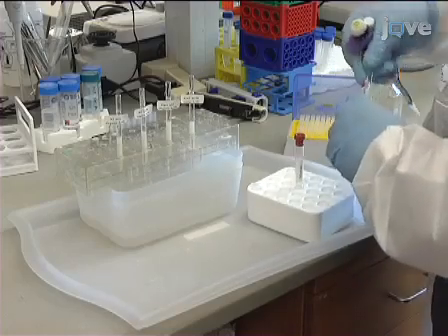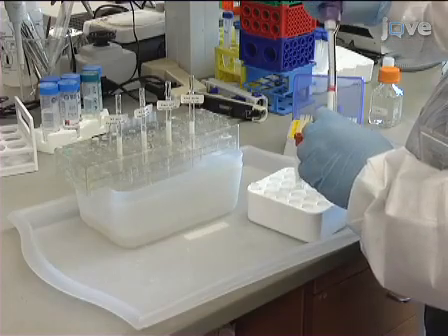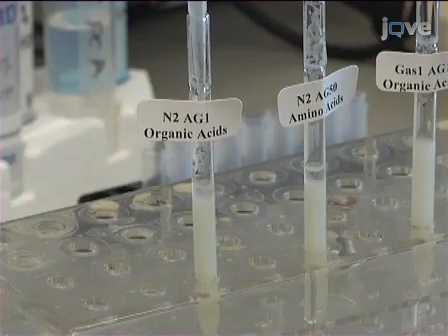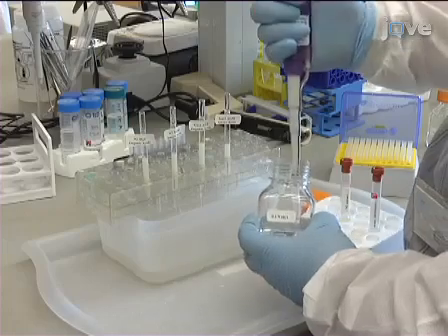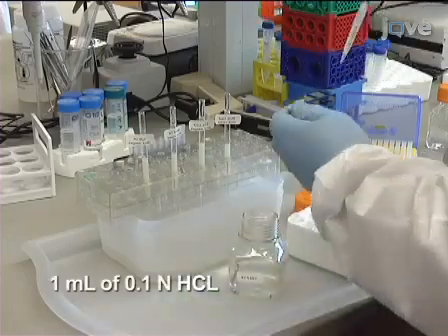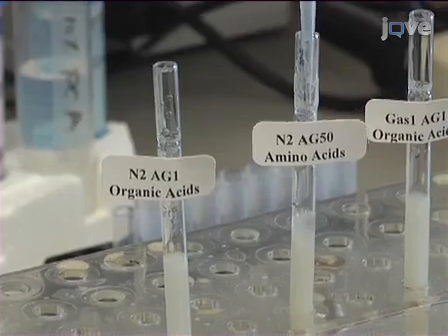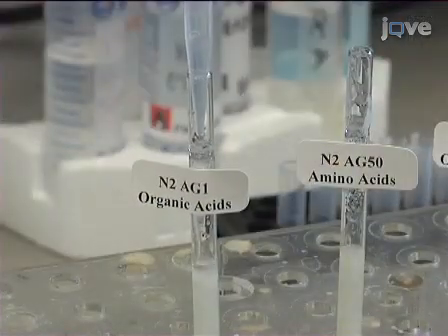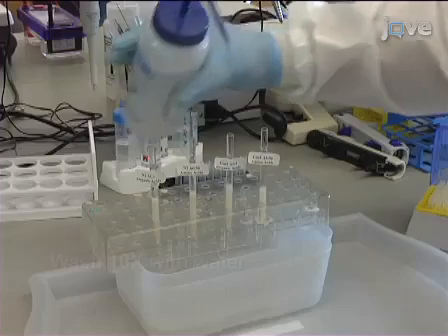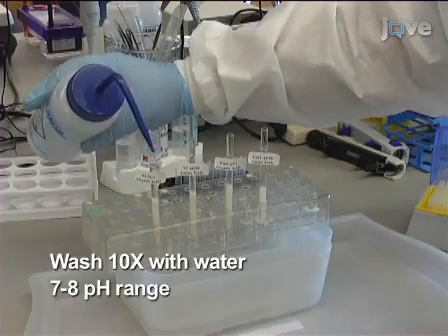If a sample is already at neutral pH, nothing is added to the sample before applying it to the Ag1 column to extract organic acids. To extract amino acids, add 1 milliliter of 0.1 normal hydrochloric acid to the sample before applying it to the Ag50 column. Now apply the previously prepared neutralized samples to each column. Wash each column 10 times with water until washings are neutral.